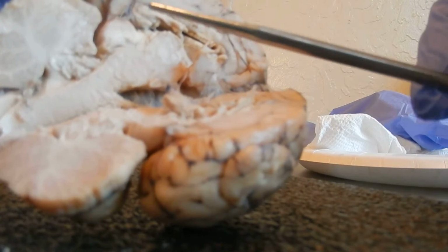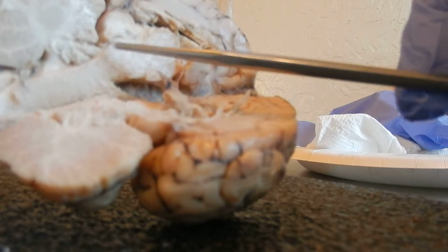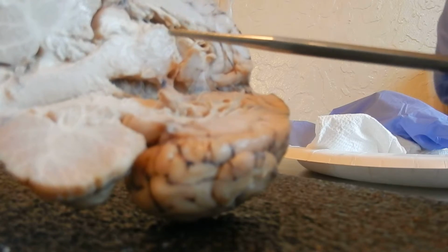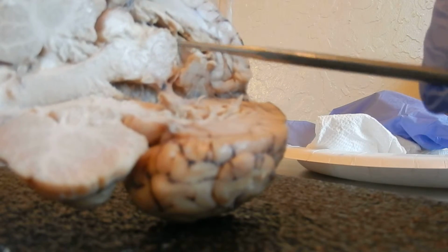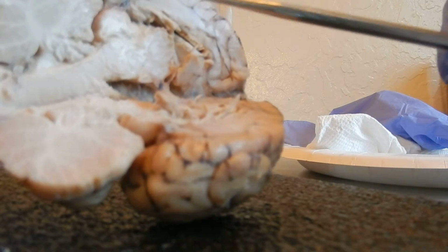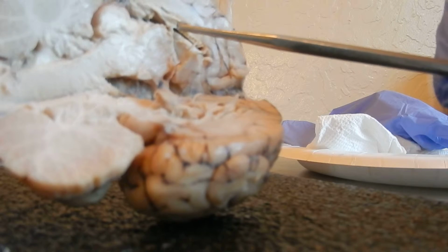You can see the splenium. Then if you dip down, you can see the lateral ventricle, the corpus callosum, and this sheath here that you have is the fornix.